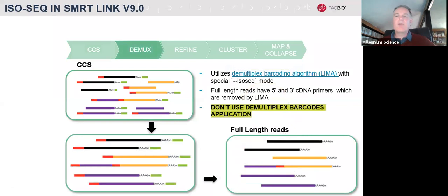So then to demultiplexing, a fairly straightforward thing in a bioinformatics pipeline. You're going to take those CCS reads. It's going to have a look at those and look for the barcodes and demultiplex those according to your various samples that you've mixed together.